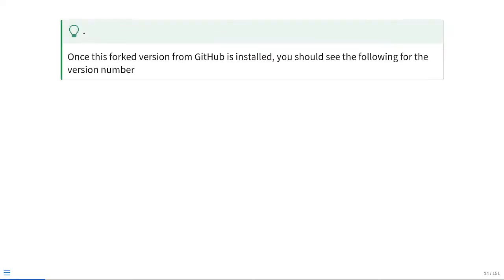And once you have installed the forked version, when you run the packageVersion function for the flowGate package, it should show up as 0.99.2, which is the one that has the bug fixes for the ggplot and ggcyto breaking bugs, so that everything is now operational.